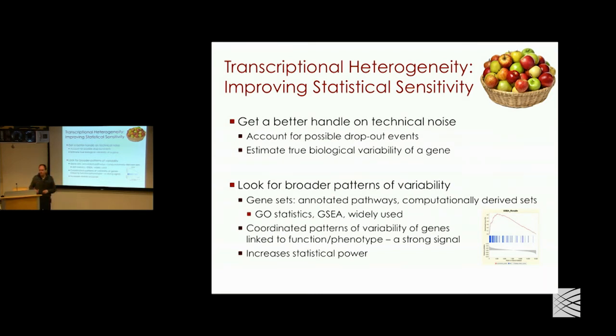It's a weak prior, so if you put in a wrong gene set, nothing bad is going to happen. If you put in too many, you'll get a little bit of a penalty on multiple hypothesis testing. But with so many cells, you typically have some leeway there.